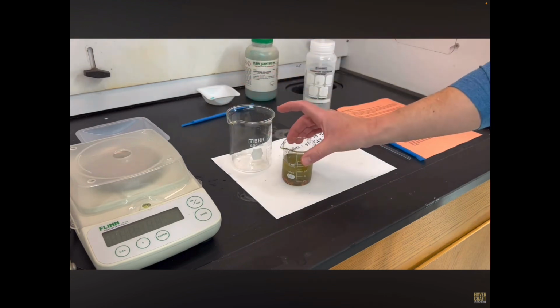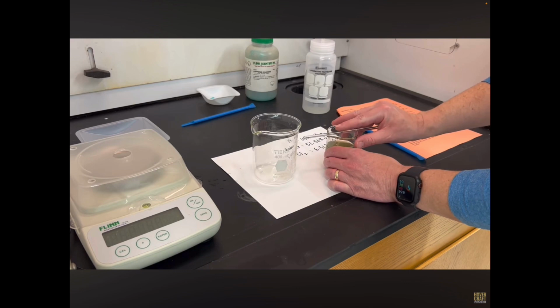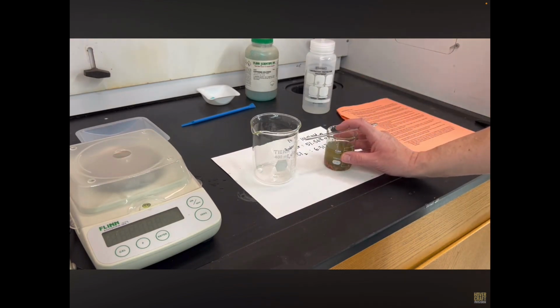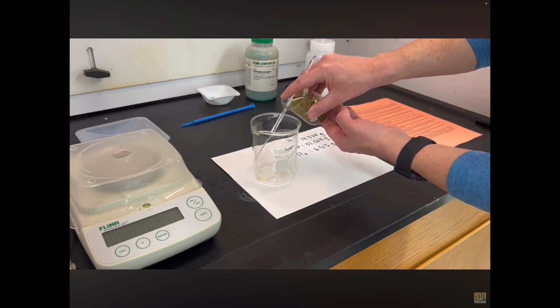So to decant, you're going to want to pick a beaker, just a waste beaker, to collect the liquid that you're pouring off. And it helps to hold a stirring rod across the beaker. That just helps as you pour, maybe stopping any solid particles that might be otherwise pouring out of the spout of the beaker. So you want to kind of hold it like that. And you want to pour slowly. And the stirring rod can also just help direct some of that liquid.